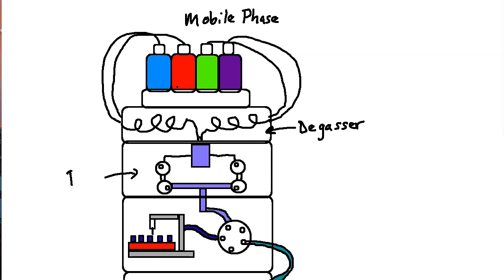So these are the pumps. Now, when you have your HPLC pumps, they use a back pressure in order to continuously, and it is very important that it's continuous and at a steady rate, move the mobile phase down through the rest of the HPLC system, across the column, and into the detector. And it's important that your pumps are in good shape in order to maintain this regular flow, which you could call the flow rate of solvent. You can adjust how quickly these pumps are working and at what pressure in order to change the flow rate.